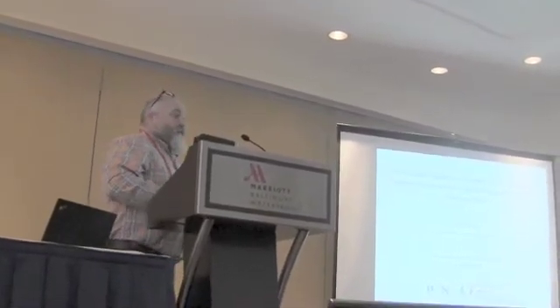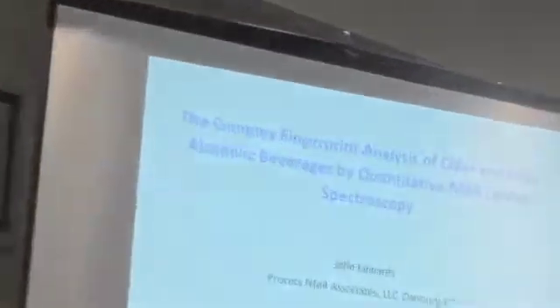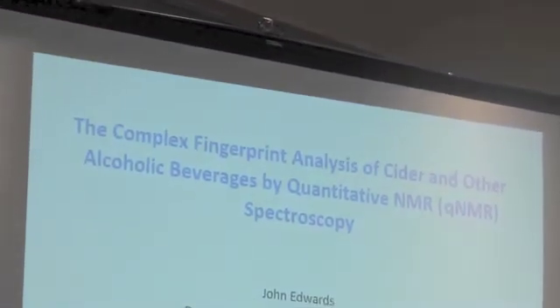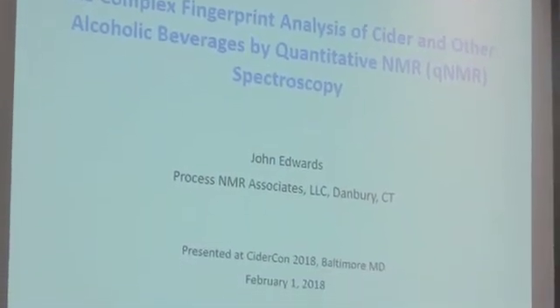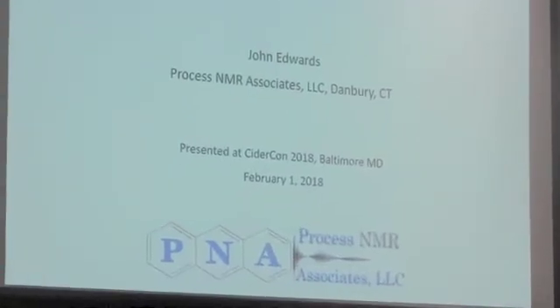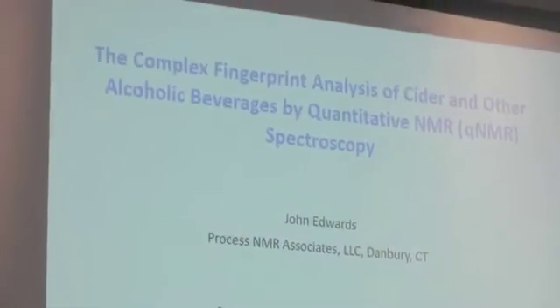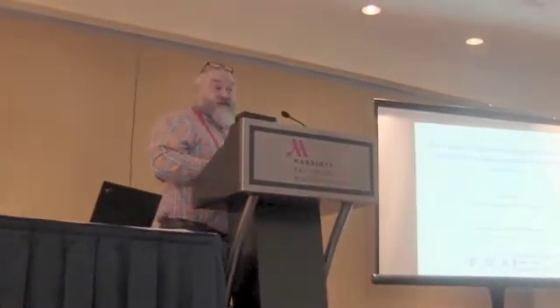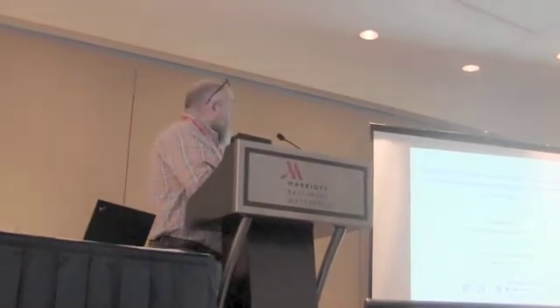So, I'm going to talk to you today about application of NMR spectroscopy, and I know this is kind of a high-end technique, and it's the machine in the chemistry department that they like to make all the students afraid of, because they don't want to deal with something going wrong when people put a sample in it. It's an expensive piece of equipment, but there's lots of people like me around that actually buy NMR machines on eBay and then keep them as, I know how to make them work. And so I've been applying it in the beverage analysis a little bit myself as a hobby, because I get to drink all the samples that I look at.